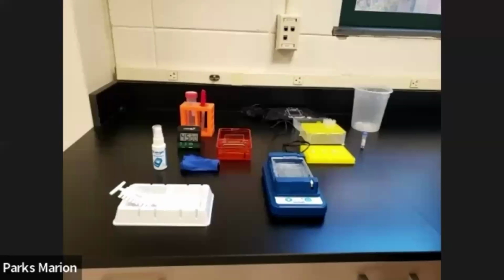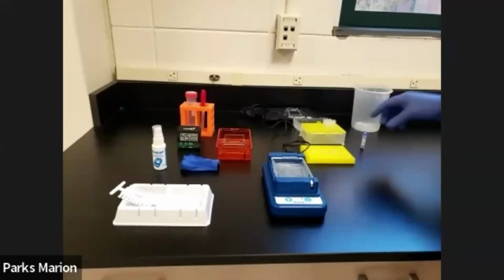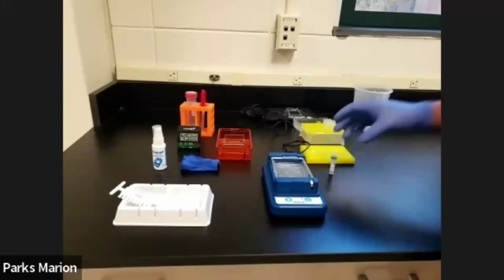The diagram shows us where we want each of the different solutions to go and each of our different samples to go. And it will indicate to you where you put your ladder, your negative control, positive control, and experimental sample. The first well is going to contain our DNA ladder.